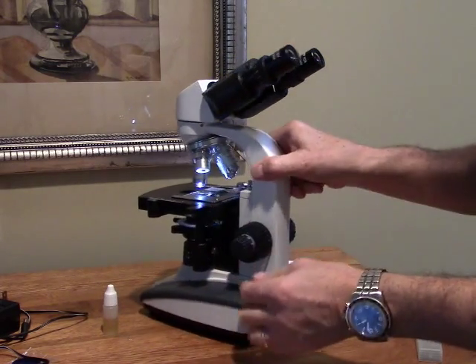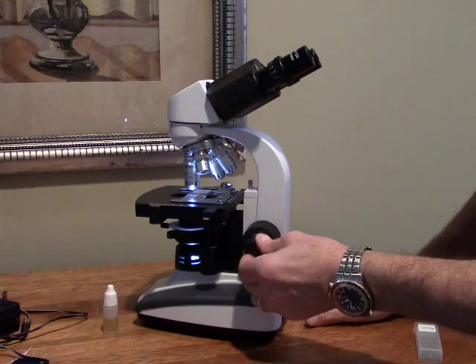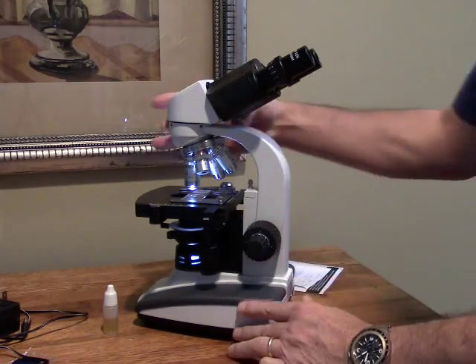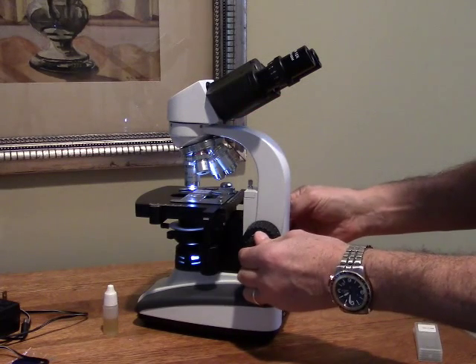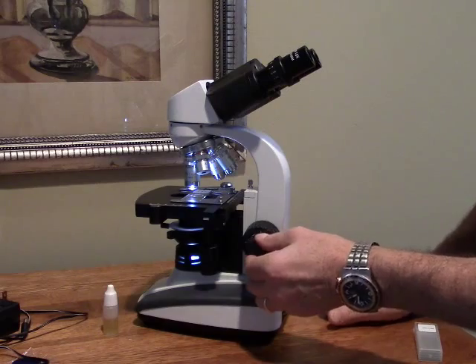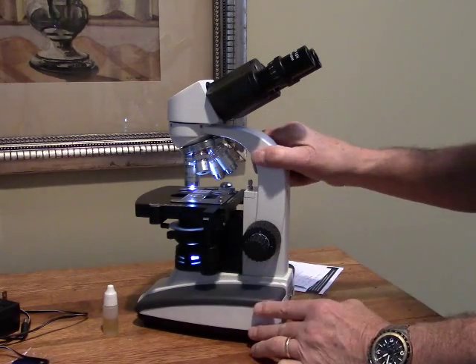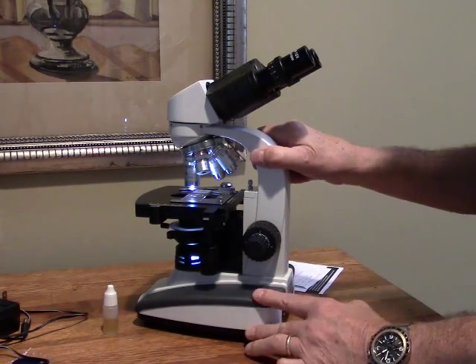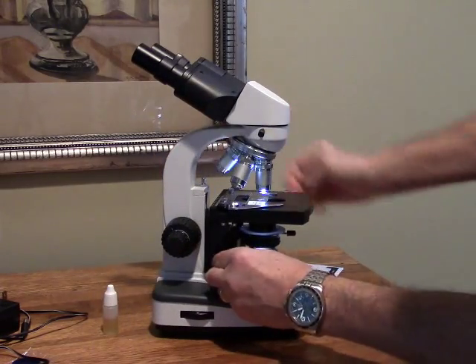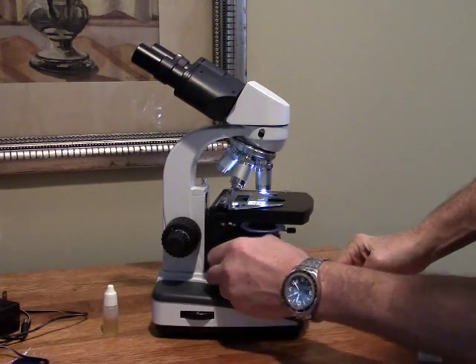The only thing I've noticed is the fine adjustment, particularly at the 100x level, is a little coarse and not quite as precise. But keeping the price in mind, it's certainly reasonable. You also have a control to adjust the focus of the illumination with this adjustment here.